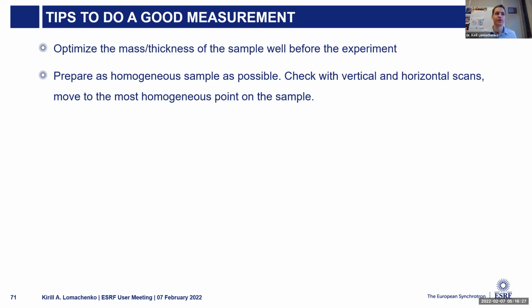If your beam moves during the measurement, which can happen because the monochromator is tired, or because there is a glitch and the beam intrinsically moves a little bit, you start measuring at a physically different point on the sample. And if in this different point the sample absorbs more or less than in your usual point, then you'll have a dip or a peak in your absorption spectrum.